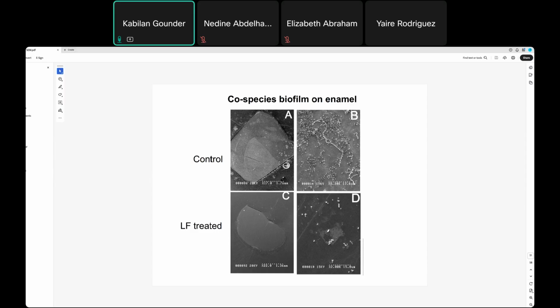So as always, it is important to note the basic principles of each microscopy, how important it is, what kind of data you are getting, what kind of structure you are getting from each one, and the process, whether the bright field microscopy and fluorescence microscopy processes are the same or not, and at what point you are changing the process.